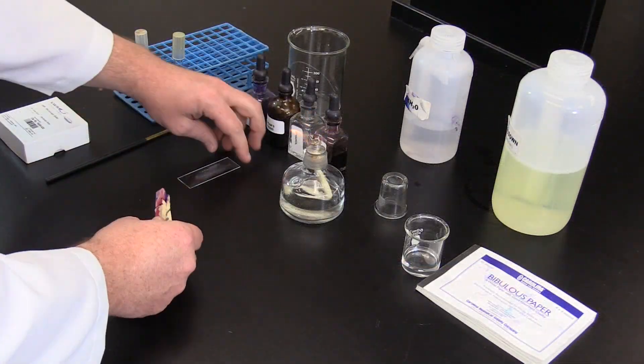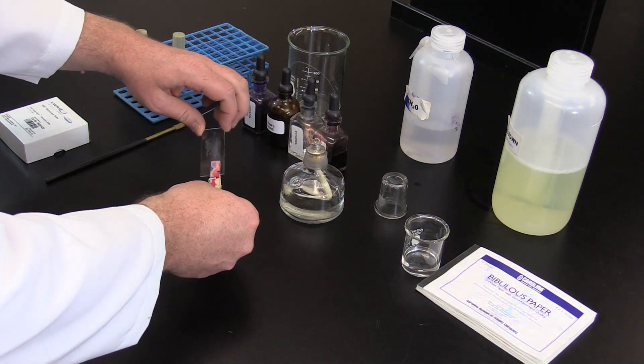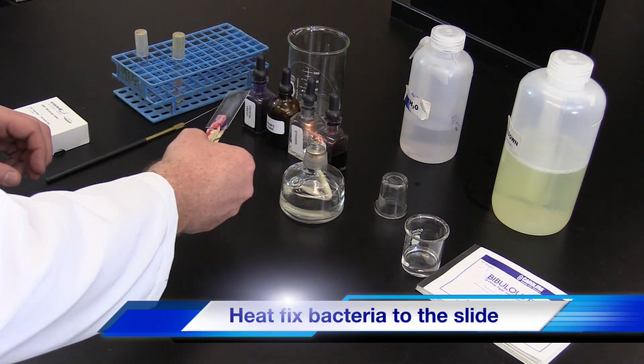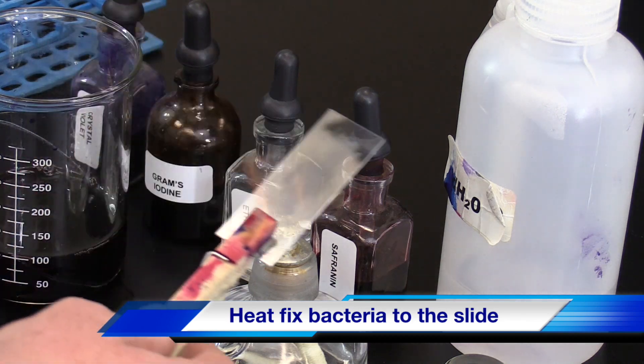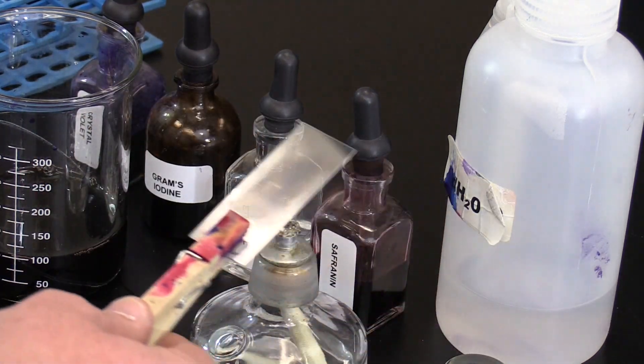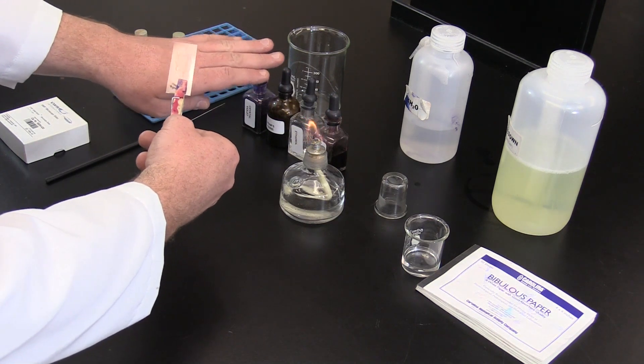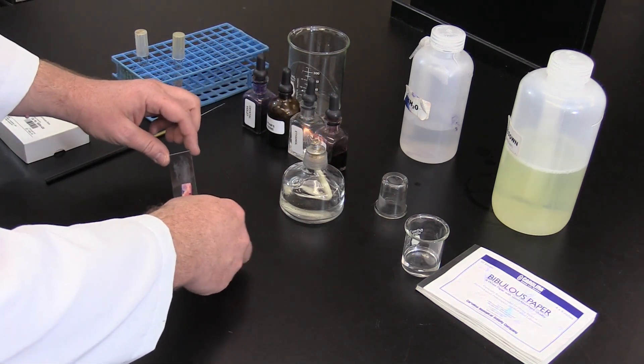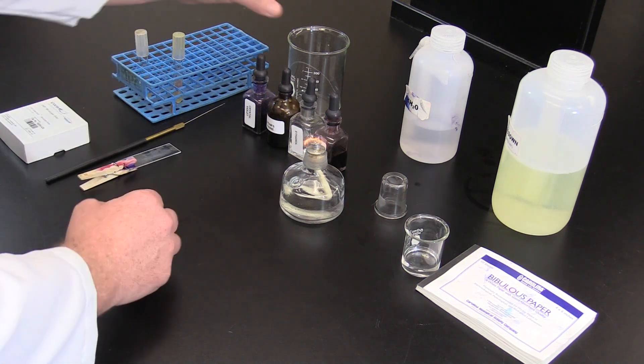Next, the sample needs to be heat fixed. This is done by passing the slide through the flame two or three times. In this way, it allows the bacteria to stick to the slide. However, if the slide becomes too hot to the touch, you'll need to restart as the bacteria have been cooked.